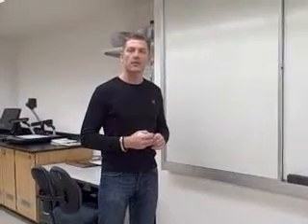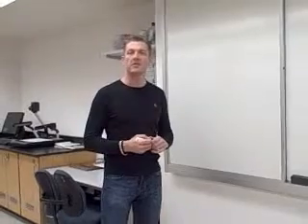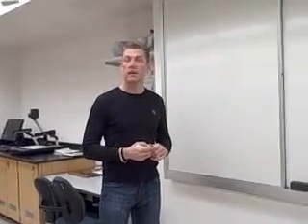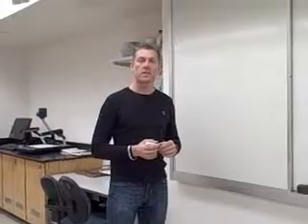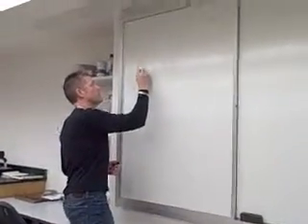Today we're going to have our first lab-like exercise. It's going to be the reaction of the element magnesium with the element oxygen. Oxygen is going to be provided from the atmosphere. And magnesium, I will show you an example of it in just a second. I'm going to draw out the chemical reaction.